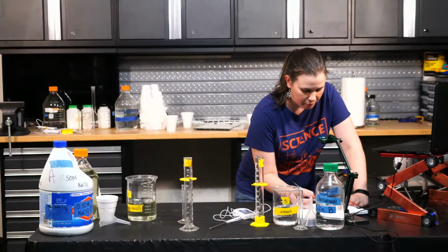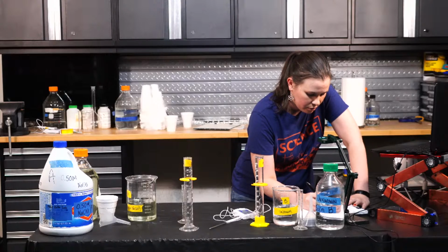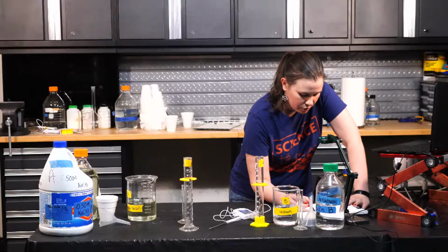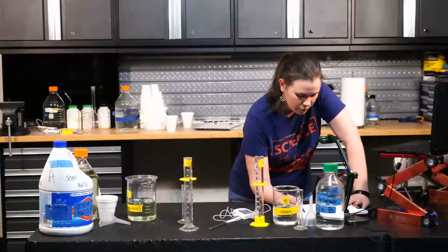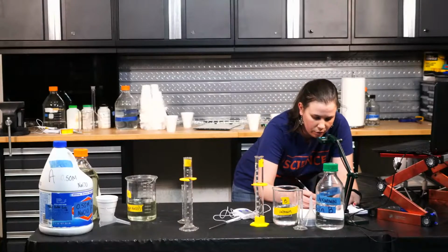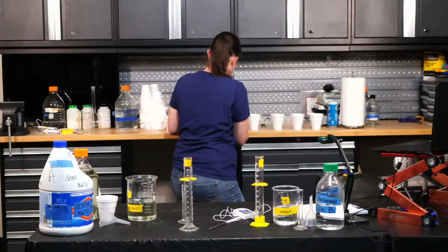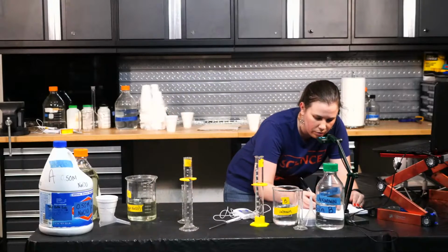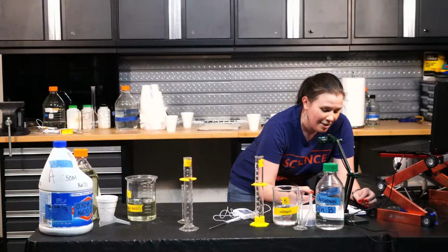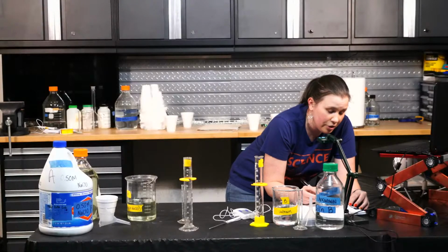So going back to the demo, because I can't show you with this slide. With the demo, we basically had a peak here at the 1:3 ratio. But over here would have been a 1:2 ratio, or maybe over here was a 2:1 ratio. This is all in terms of iron nitrate coming first. I think the left one was 1 to 5? Wait, 1 to 5 wouldn't have been over there. 5 to 1 would have been over there. Maybe I flipped them. That would explain why it's confusing, because I said left was next to a limiting reactant. So maybe I flipped the graphs.